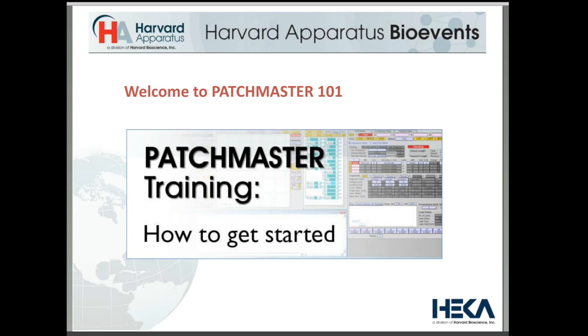This presentation is focused on giving you a high-quality overview of the PATCHMASTER user interface and to orient you to its capabilities and methods.